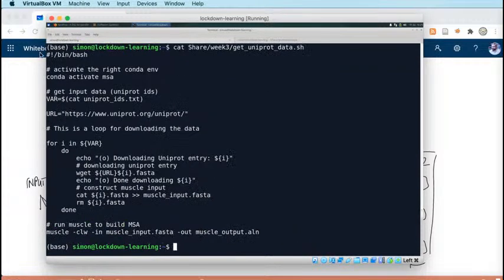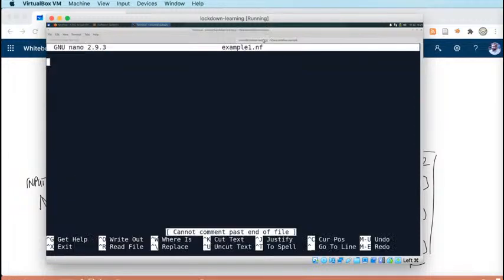There we are. There's our hash character. So we'll paste that in there. Why didn't that work? Okay, I don't know how I turned on line numbers there. Let's not worry too much about that.